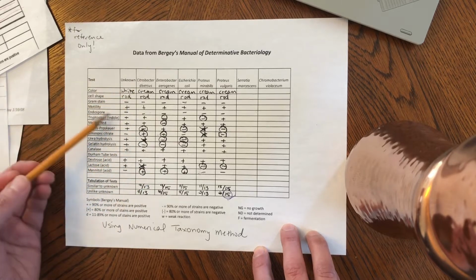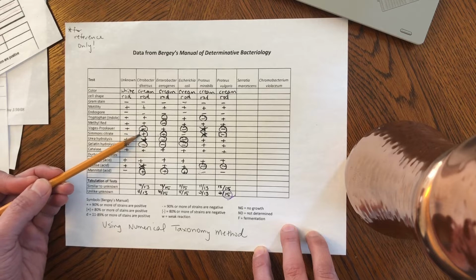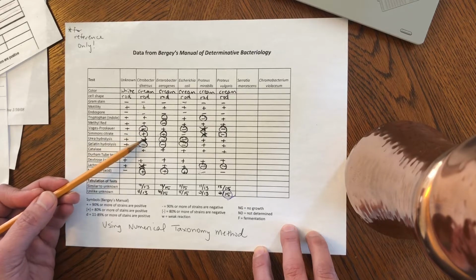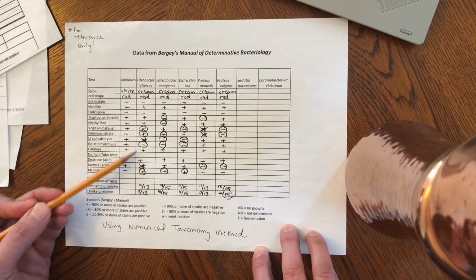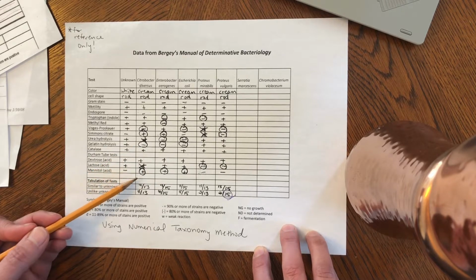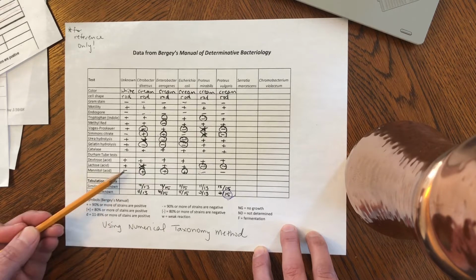Let's look at Citrobacter diversus specifically. I circled Voges-Proskauer because it doesn't match. Simmons citrate because it doesn't match. I crossed out that D that's right there. I circled gelatin because it doesn't match. That lactose is crossed out because it's a D. And then the mannitol is circled because it doesn't match.